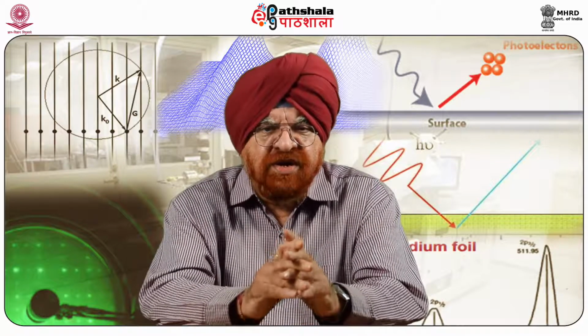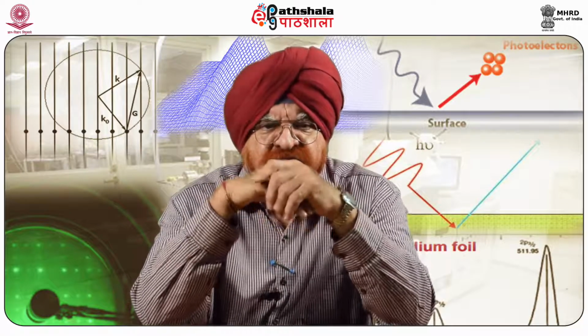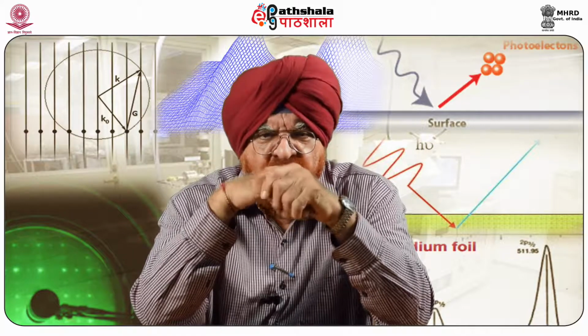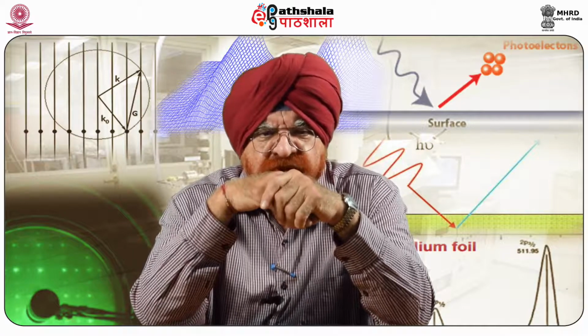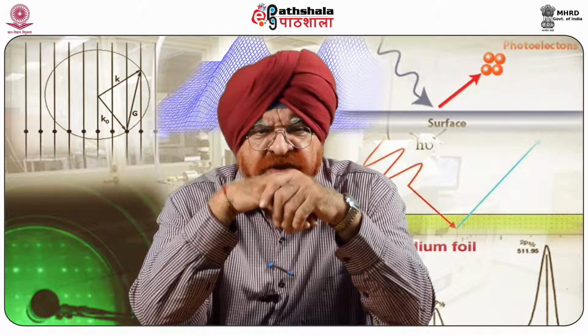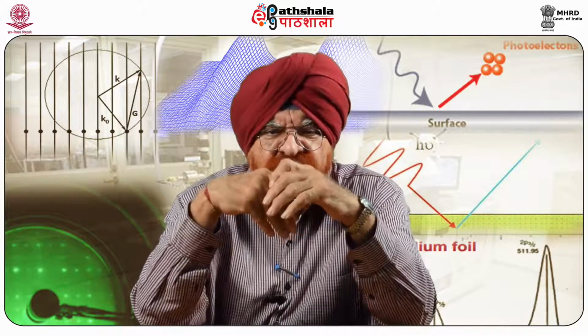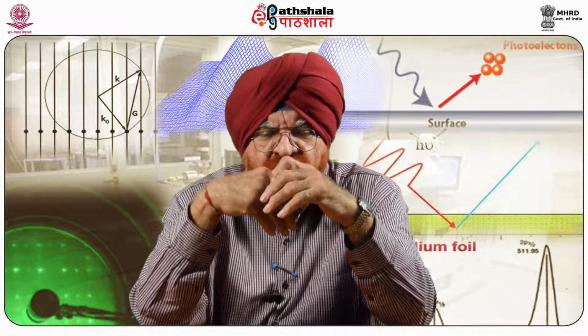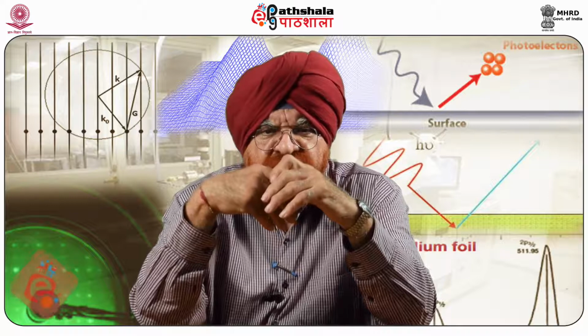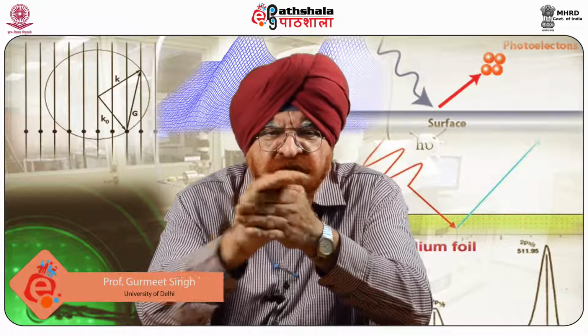When annealed at high temperatures, the XRD results indicate the presence of non-magnetic phases in the films containing cobalt. In addition to this, it is known that cobalt is less efficient than manganese in promoting ferromagnetic alignments and a high magnetic moment in the case of germanium. Cozenza et al. in 2006 had done the same thing. Therefore, we expect a similar magnetic behavior from cobalt in the silicon matrix.